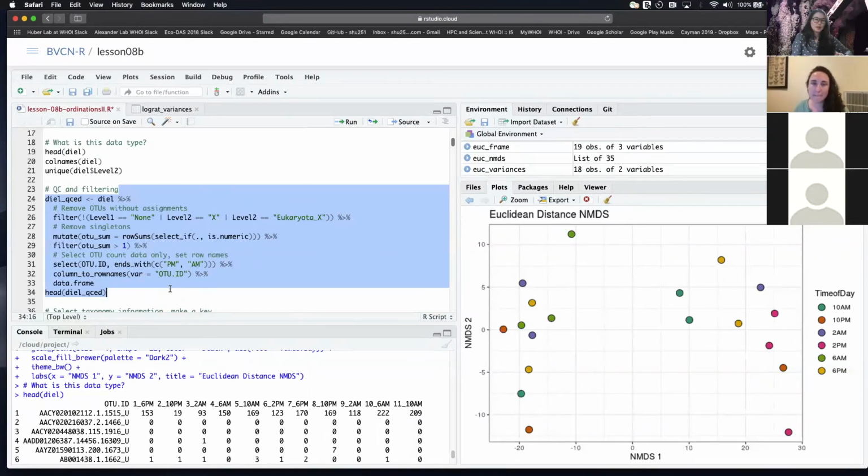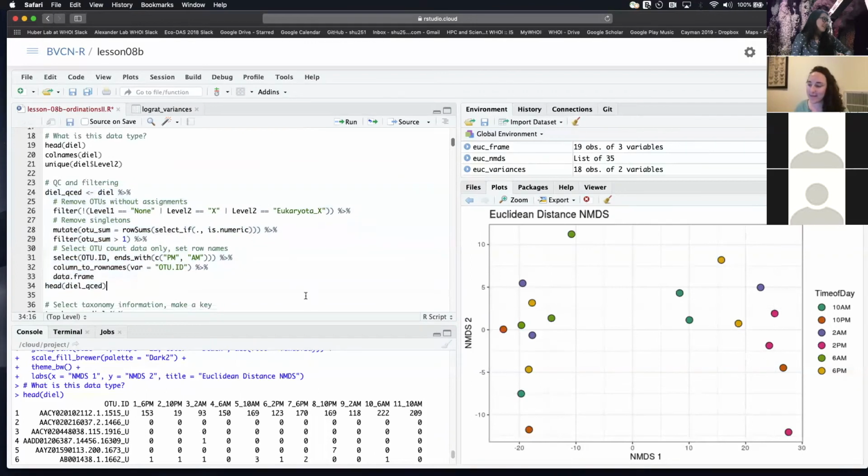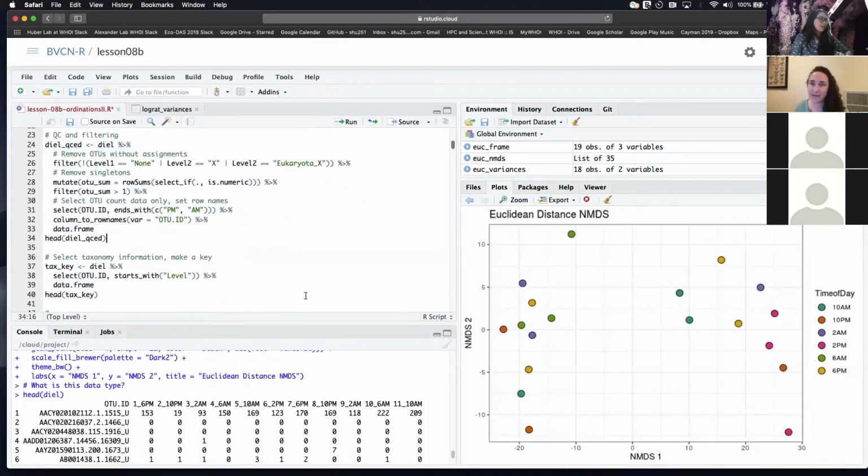This lesson was kind of short with the rest of this code. But Liz, if you have anything to add, especially when it comes to dealing with zeros and outliers, I know that the ordination lesson that you did was based in phyloseq, which is something that I also use. And I just use all of these approaches to see how I best want to represent my data, or what best distance matrix seems to work. So any other best practices that you want to share?